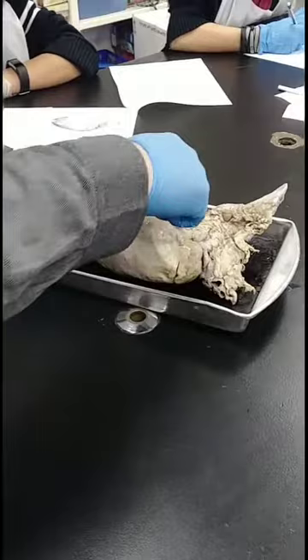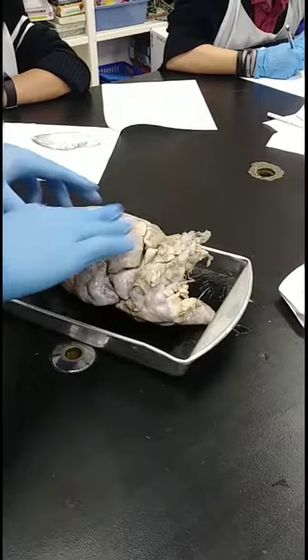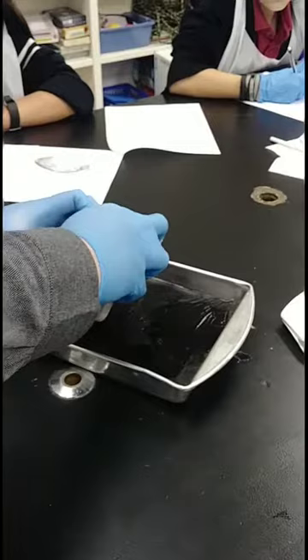Remember, this is 3D, so the ventricle wraps all the way around the heart, right? So draw and describe that. Follow step one. You have a lot of the aorta complex up here. This covers the atrium, it's an auricle. And this big thick structure here is the aorta coming out of the top of the heart, going all the way up to here.